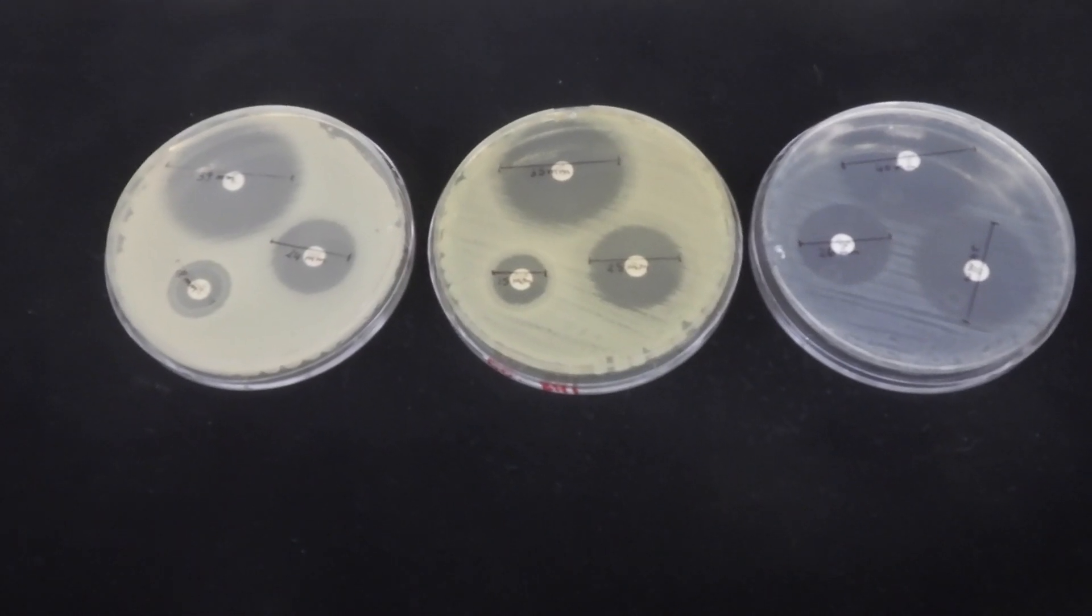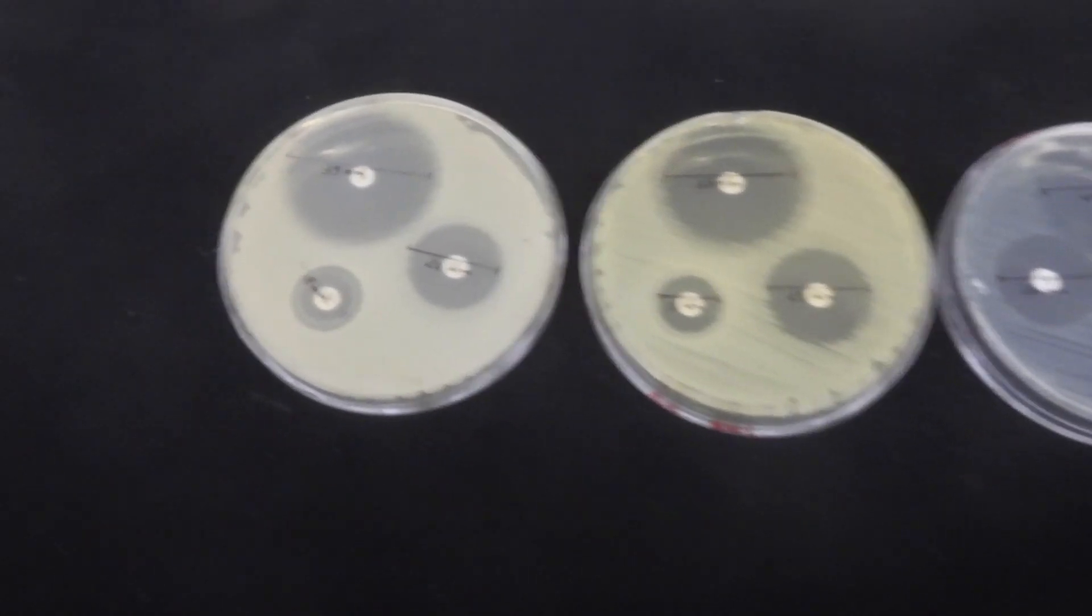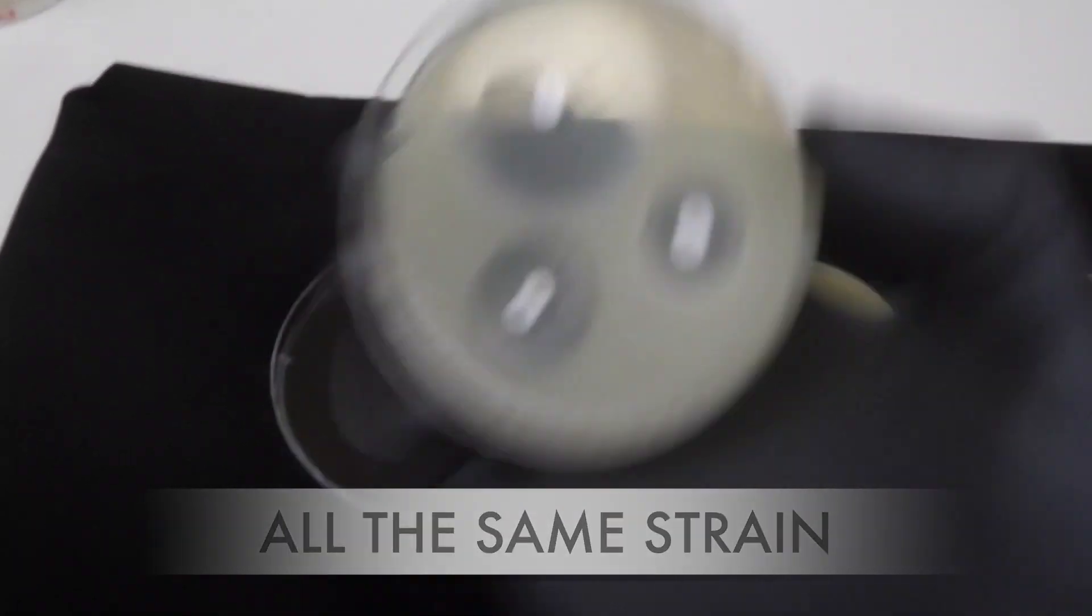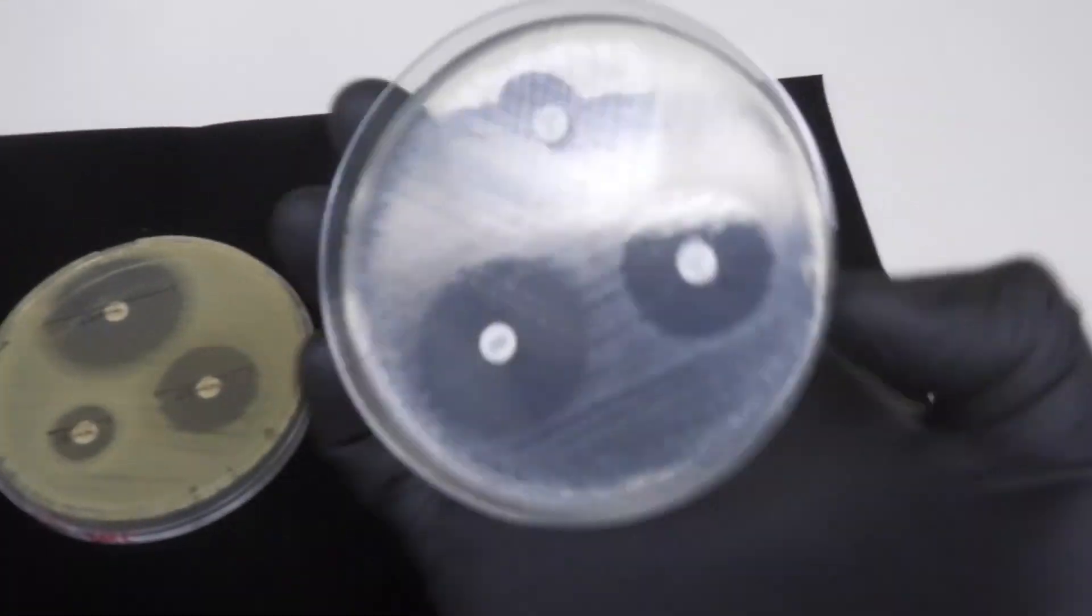On these three plates you can see the results of our test of an E. coli on Mueller-Hinton agar on the left, this is our standard condition, BHI agar in the center, as well as nutrient agar on the right.